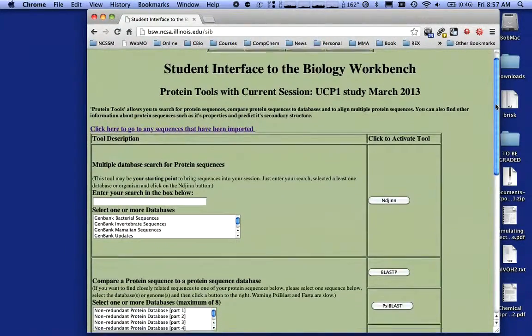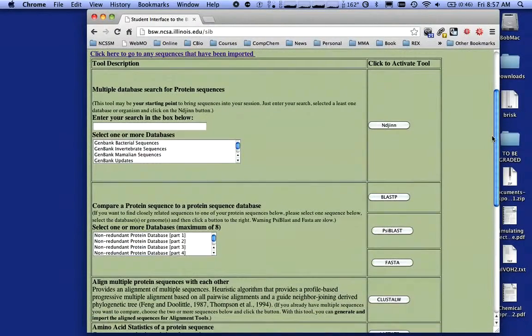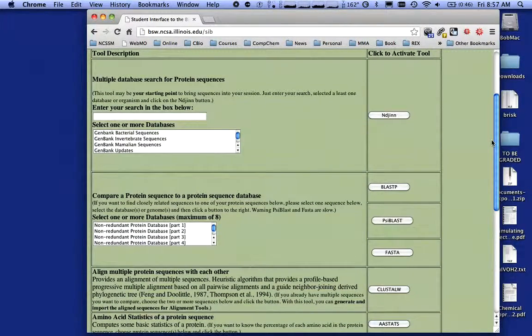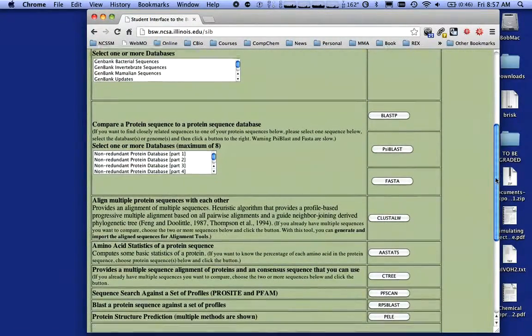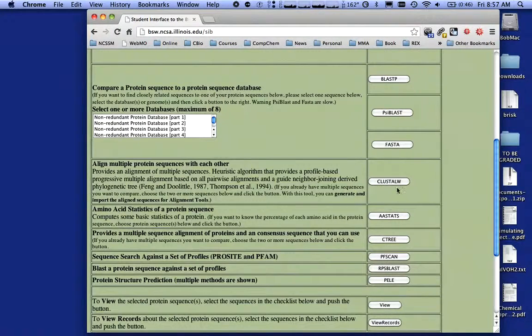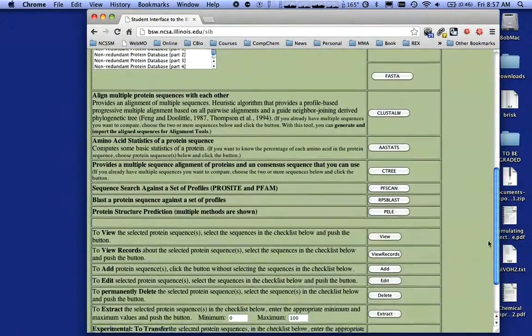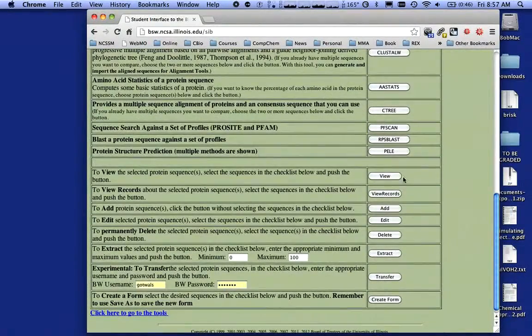What you're going to see now on the right-hand side are a series of tools used in bioinformatics. There's an Ndjinn tool, a tool called BLAST and PsiBLAST, a tool called FASTA, a tool called Clustal, AASTATS, Ctree, PFSCAN, RPS Blast, and Pele, and then some data and file options.